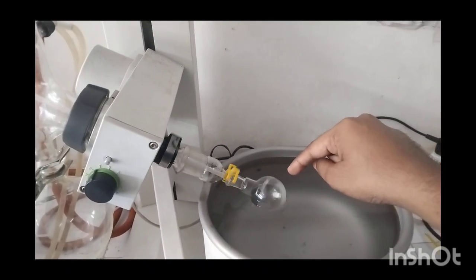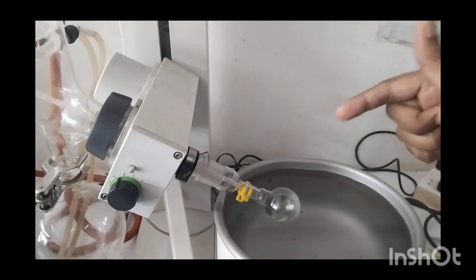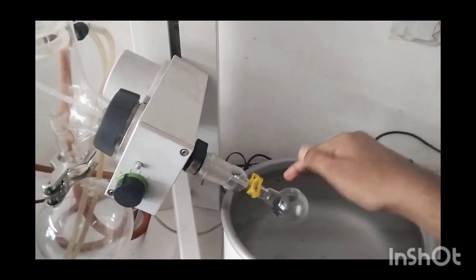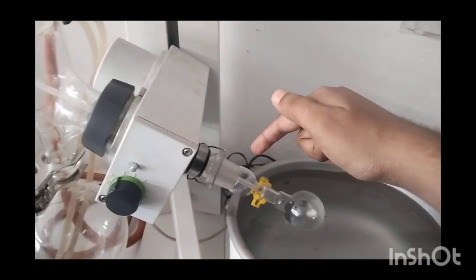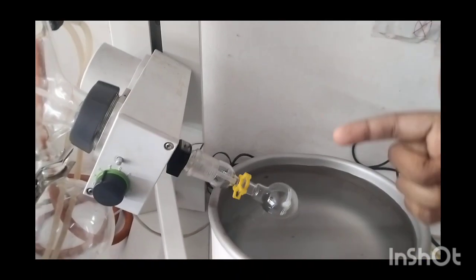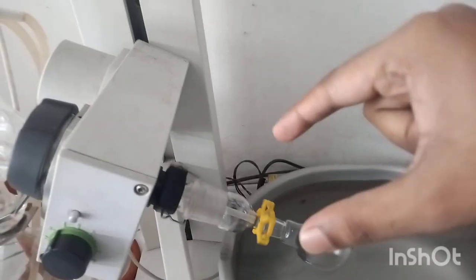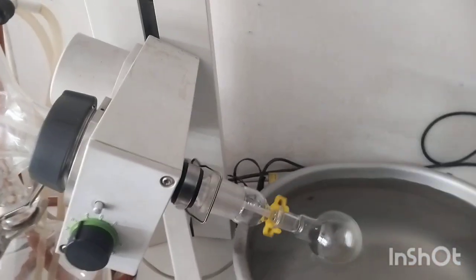So that's it. When you'd like to use this specific system, then obviously you have to use this RB bottle, that is rotating. We are using a rotator, and by means of rotating it will mix properly, and the drying process will be done properly. And we have used a clip in this junction point, the junction point of the adapter and RB, so that it cannot loosen, and it can easily dry.